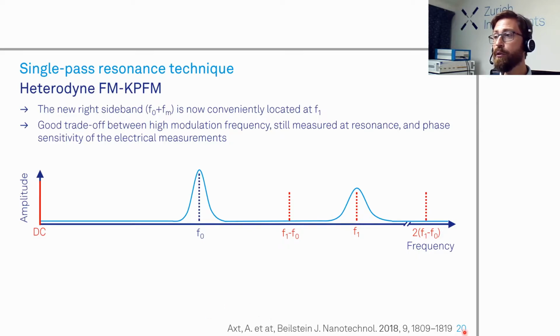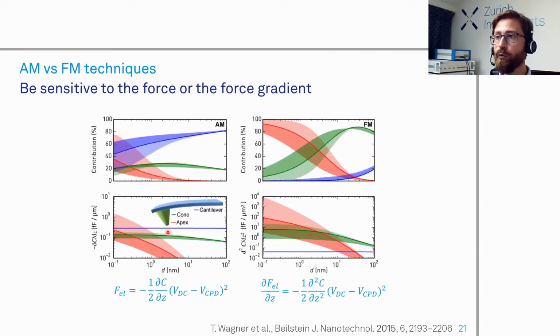I actually recommend you to look at this nice paper from Amelie Axt, who is reviewing all these different methods and having some more example on heterodyne as well. And we will of course go through this during the demonstration. But why do we want to be sensitive to the phase anyway? Because it looks like more complicated, and you need some phase sensitivity and all that.